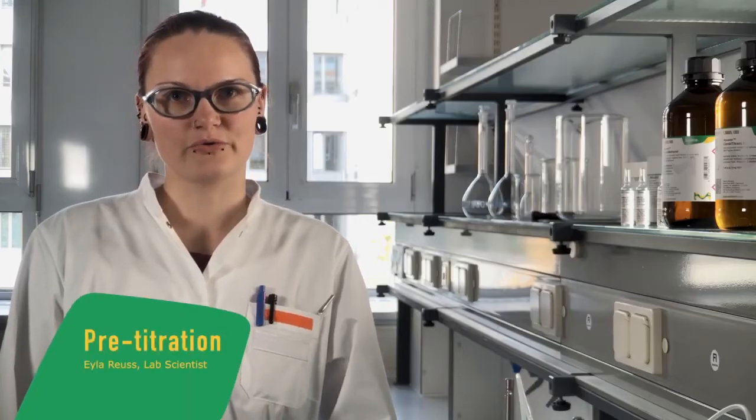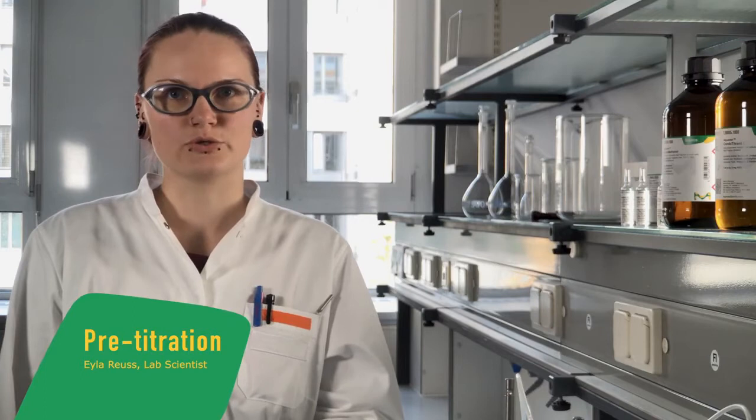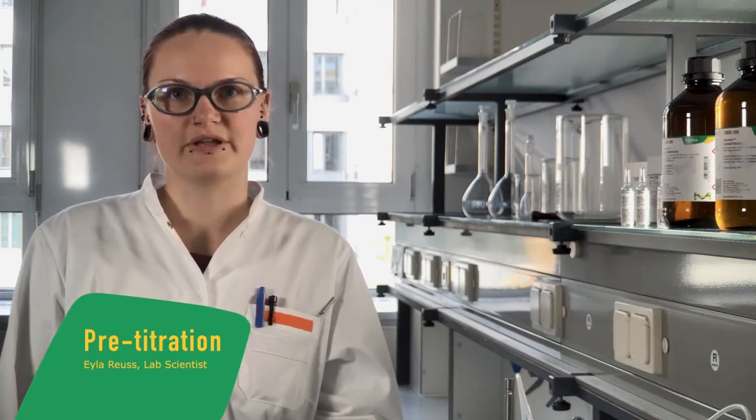In this video I'm going to show you how to perform a pre-titration or conditioning in the volumetric Karl Fischer titration. My name is Ayla Reuss, I'm a lab scientist.